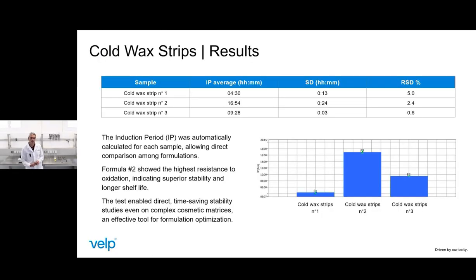The induction period for formulation 1 was about 4.5 hours, with a relative standard deviation of 5. For formulation 2, it's 17 hours, let's say, with a relative standard deviation of 2.4. And for formulation 3, it's 9 hours and a half with a relative standard deviation of 0.6.